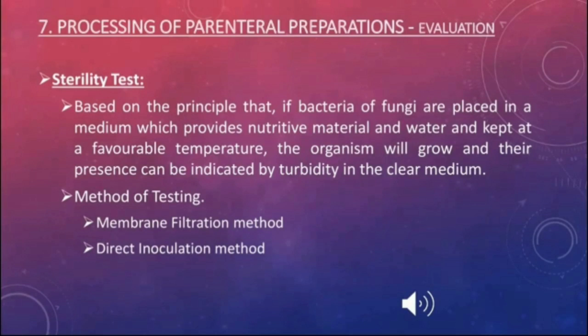After the filtration, the membrane is removed aseptically from the metallic holder and divided into two halves. The first half is transferred into 100 ml of culture media meant for fungi and incubated at 20 to 25 degrees Celsius for not less than 7 days. The other half is transferred into 100 ml of fluid thioglycolate medium and incubated at 30 to 35 degrees Celsius for not less than 7 days. Observe the growth in the media.